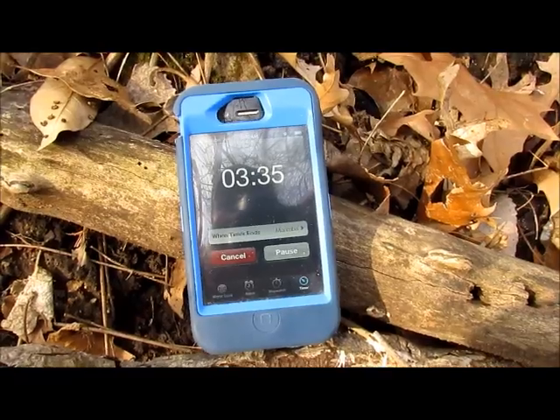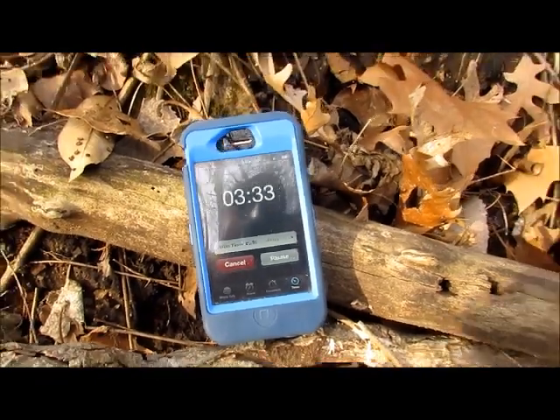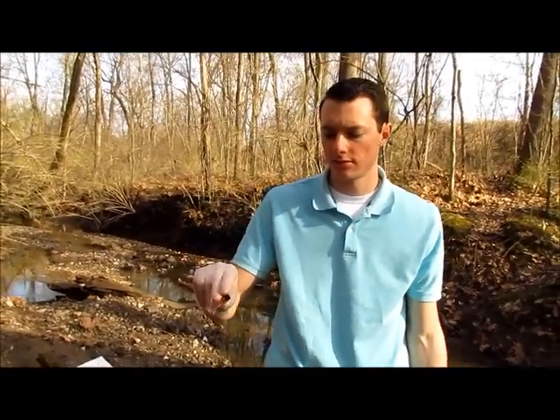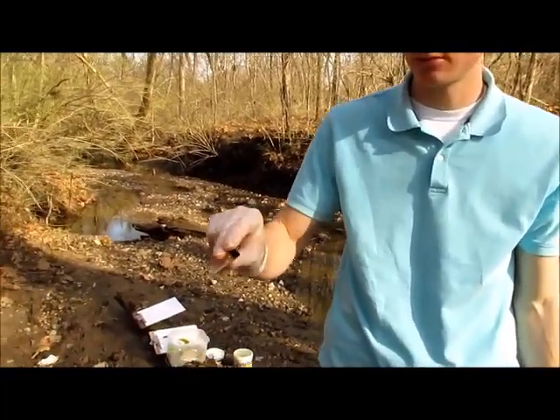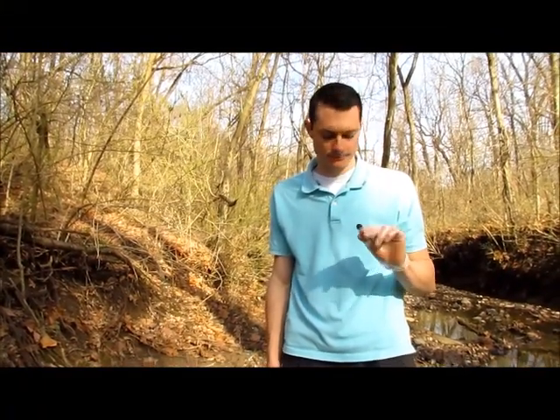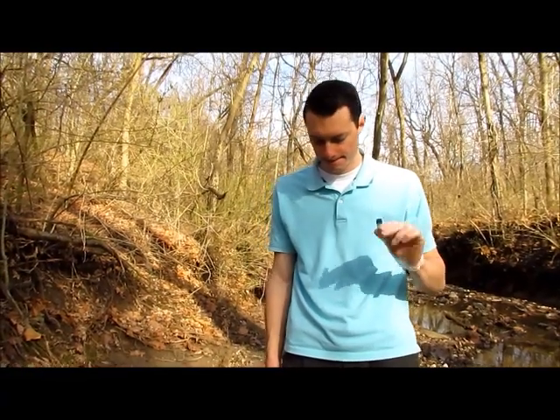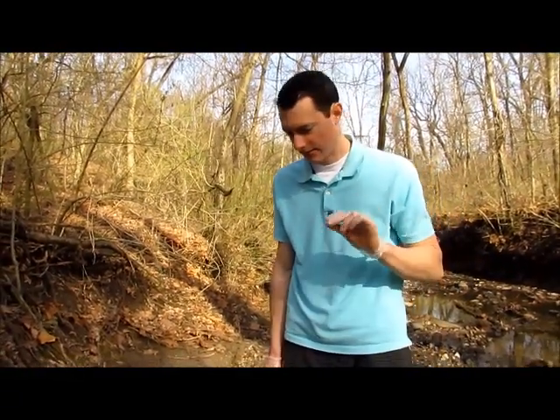Start your timer at four minutes to time yourself as you mix the vial to dissolve the tablets. You'll want to invert it back and forth — you don't want to do a violent shaking motion, just invert the vial. You'll do this for about four minutes, which ensures ample time for the water to dissolve the tablets.